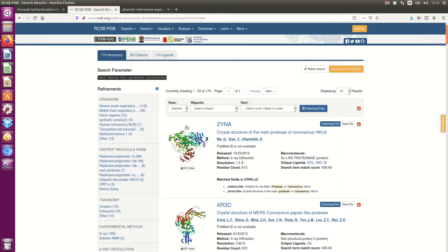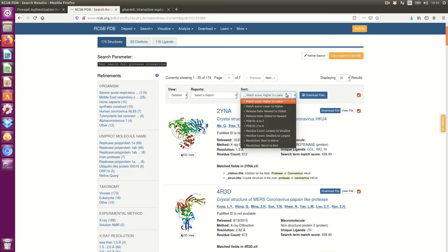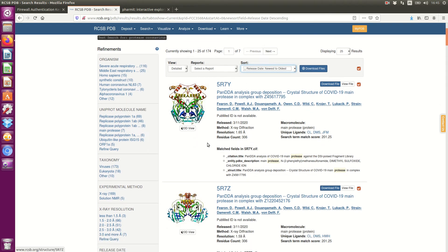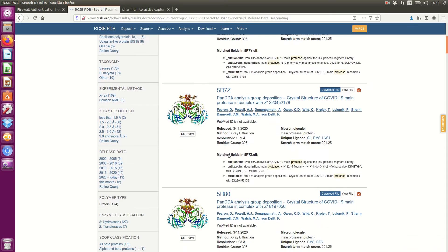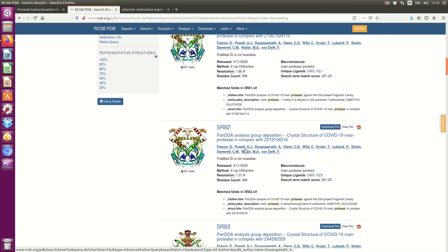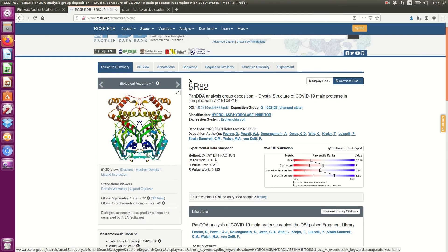We have several molecular targets, but since the virus started to appear around the world recently, I choose to sort from newest to oldest. You can see several proteases of this virus. I will take this one because the resolution is very small. Here you can see the PDB code.